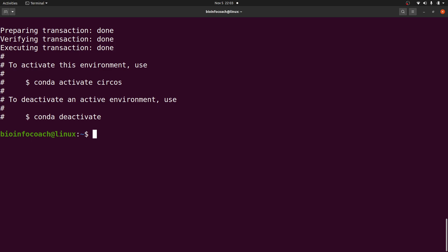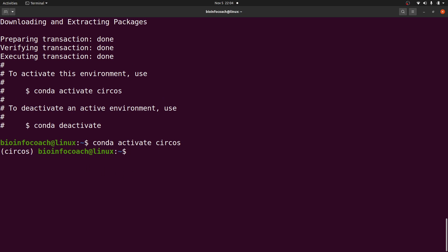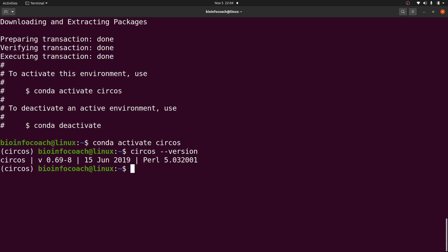Circos has been installed. We have instructions here on how to use Circos. If you want to use Circos, you need to make sure you have activated the environment — the environment name is called circos as well. So I'll activate it with: conda activate circos. Now we are going to test Circos. I'll start with the version: circos --version. This will list the version for me.